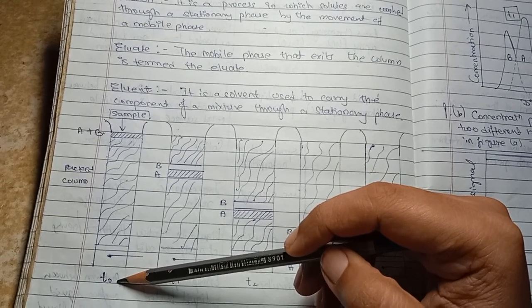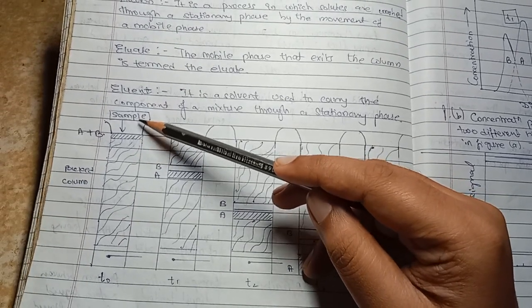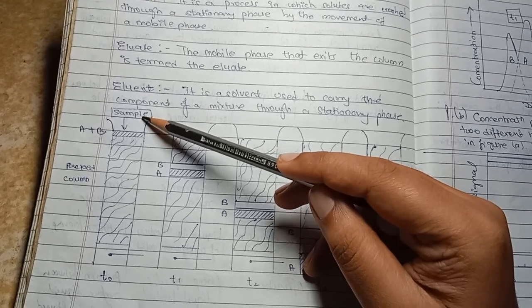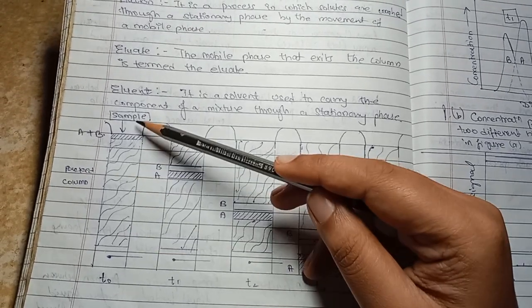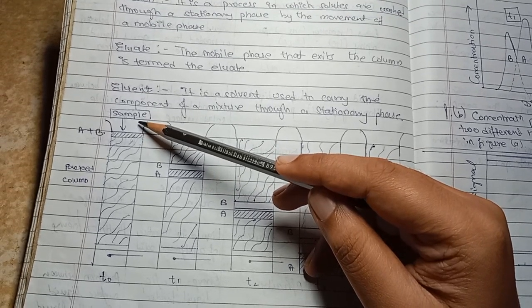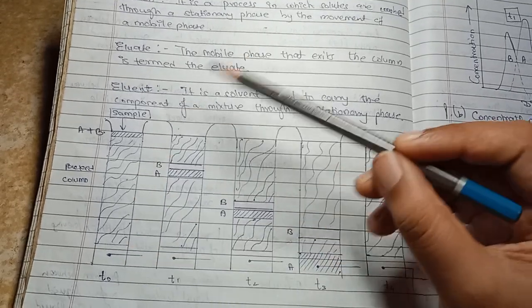Now this is t0. That means we are going to put this mixture of components as a sample so it gets separated. So here we pour this sample, the mixture of components, into the packed column.